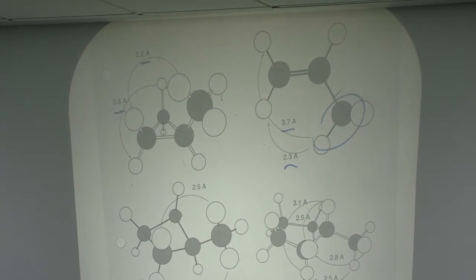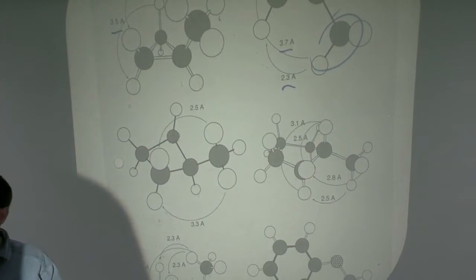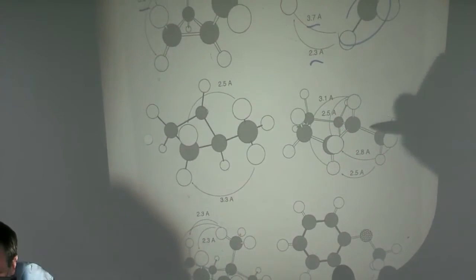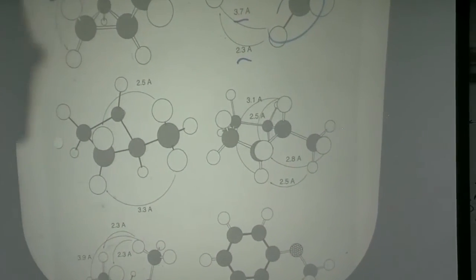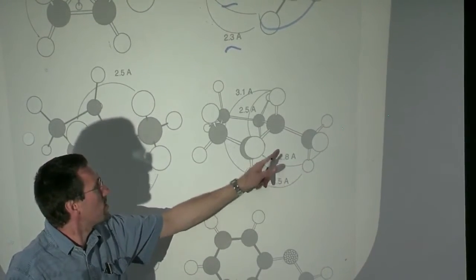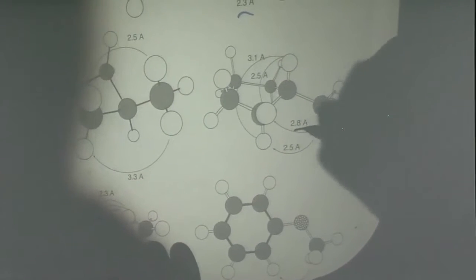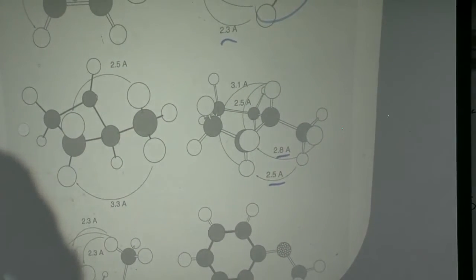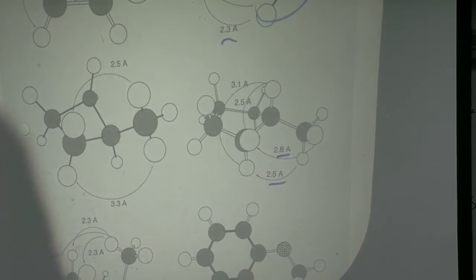Cyclopentanes can be very tricky. You know, NOEs really aren't a litmus test with cyclopentanes. I put a methyl group on a cyclopentane, and you look at the methyl group, and yeah, it's close to the cis hydrogen. It's also close to the trans hydrogen. You're going to be getting some 5-membered ring compounds, and you're going to have to look at multiple NOEs to see which is close, which is far.